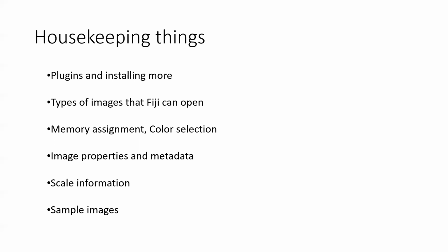Early on you had to install the bioformats importer and then use that to open. And now with Fiji, everything is so seamless that you can drag your image into the Fiji toolbar, and it brings up the bioformats importer. Fiji knows that you are opening an image which is part of some other microscopy platform, and boom, it opens up right away.